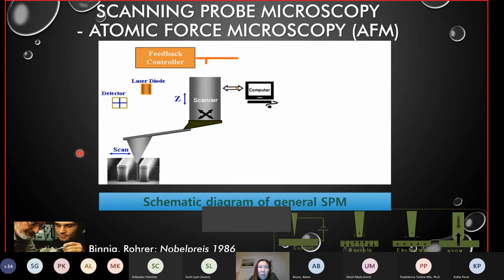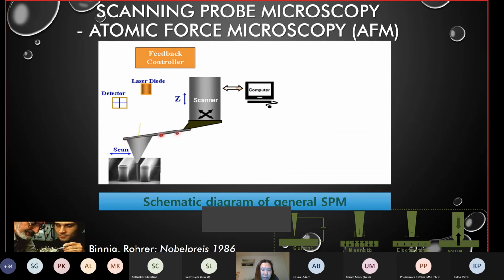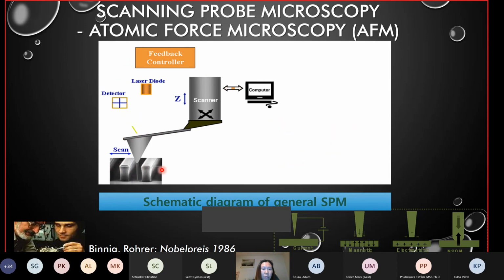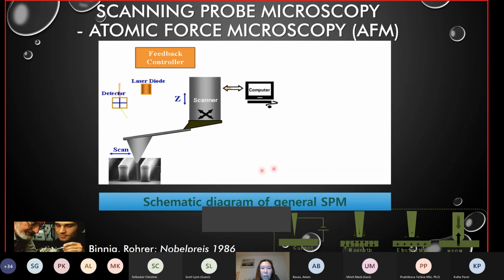As we are all working in nanotechnology, probably everybody here knows about the scanning probe microscope or atomic force microscope, which was invented about 40 years ago. To refresh how AFM works, we use this AFM cantilever to scan the surface, and we detect the movement of the cantilever using a laser and a 4-segment photodiode, and then we can convert this to the 3D structure of our sample surface.